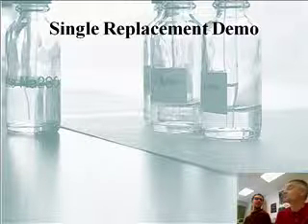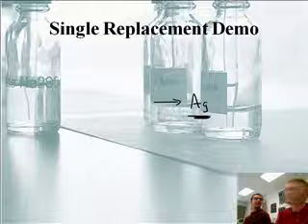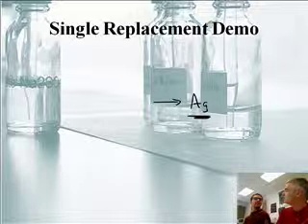And we forgot to finish this one, actually. That was pretty cool. So you got just silver, actual silver coming out of a solution. One thing that's very cool about these reactions is you tend to get these sort of precious metals in their pure form out.